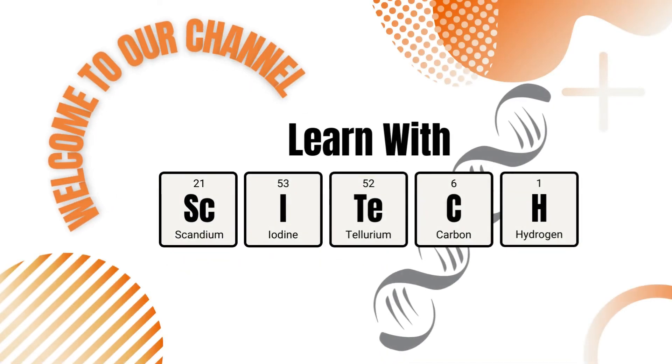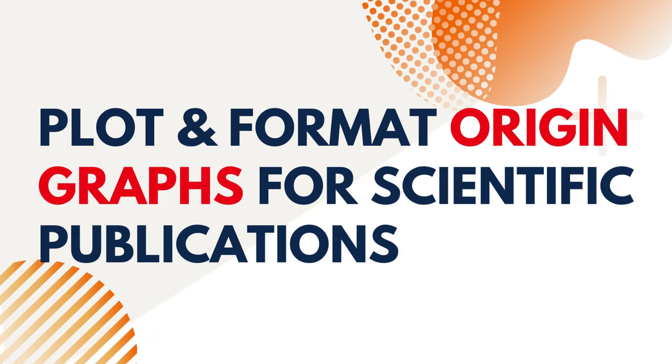Hello! Welcome back to another episode of Learn with SciTech. Today, we'll look at how to plot and format graphs in Origin software for scientific publications. So let's get started.